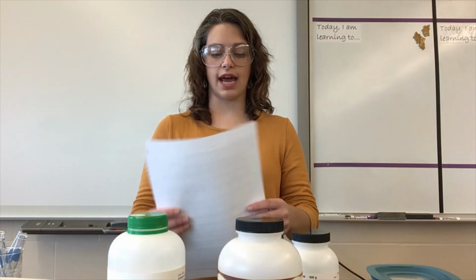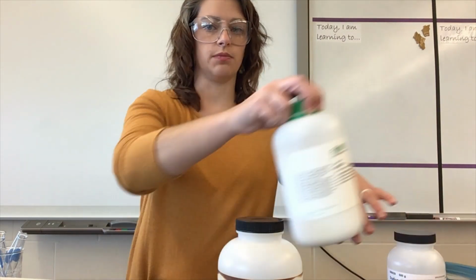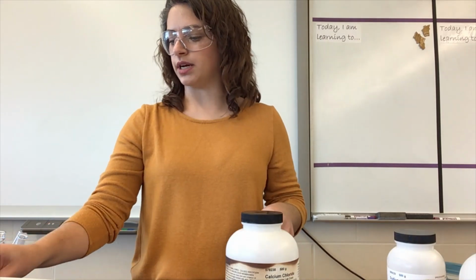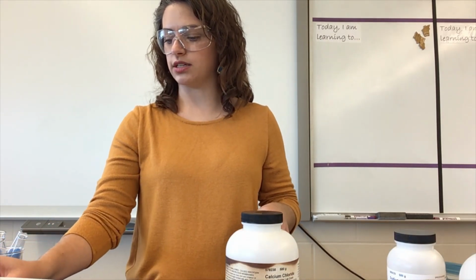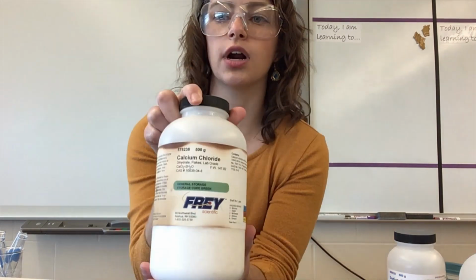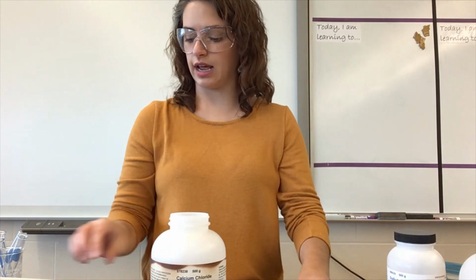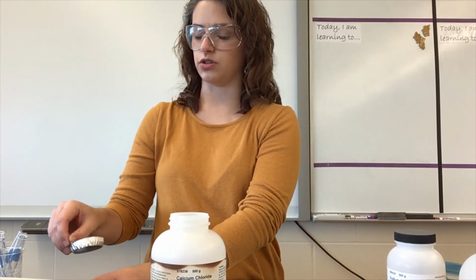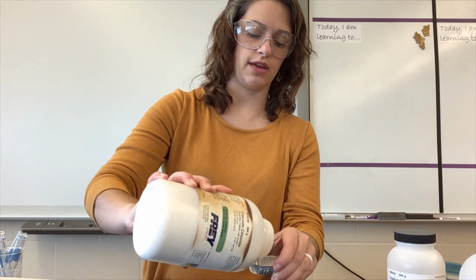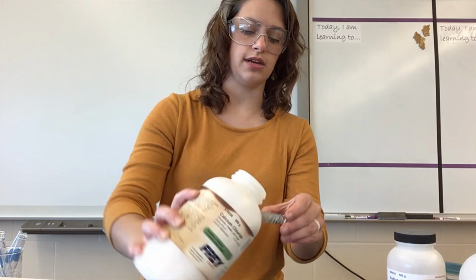Okay, so we're going to go down our list. And let's start with our calcium chloride. I'm going to move everything else off to the side. I'm going to go ahead and turn my hot plate on just so that it's ready to go. Okay, so we're starting with calcium chloride. And I'm going to take some of this and pour it out into a little aluminum weigh dish here so that we can, even though we're not massing it today, it still makes it easy for us to be able to see.